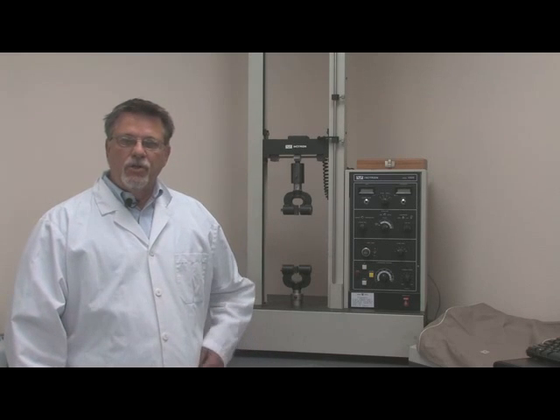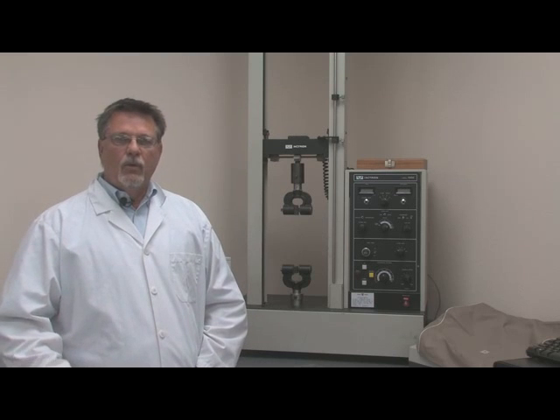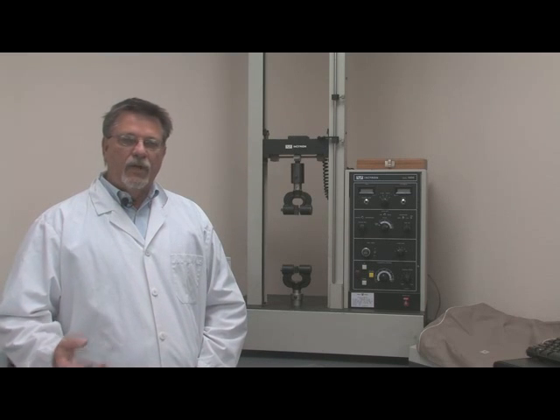The Instron is the machine that we use to do all that qualification work on. It's a workhorse. We've had it for a long time, and it certainly comes in handy when we're doing these special tests. The one thing we do here in the lab is a lot of development work with chemistries and adhesives and substrate qualifications and so forth.